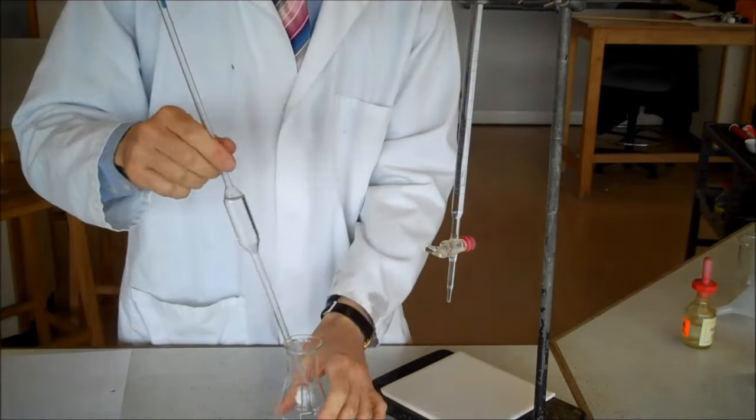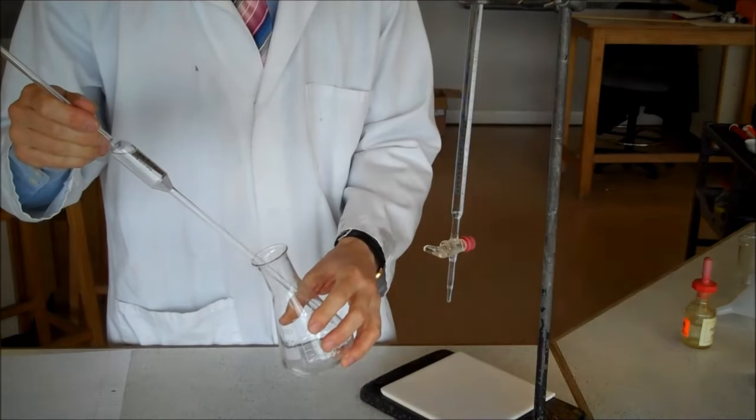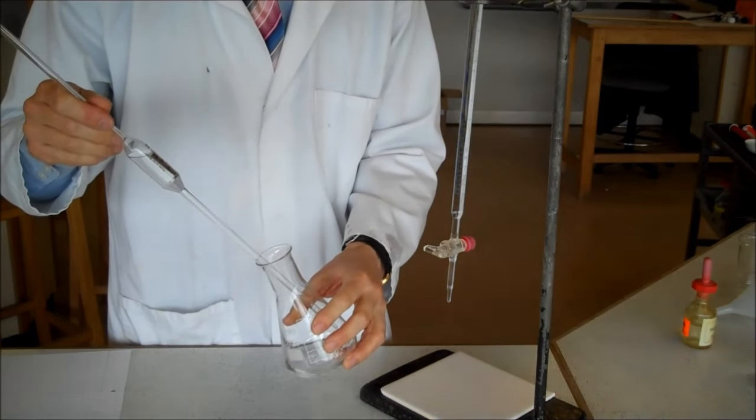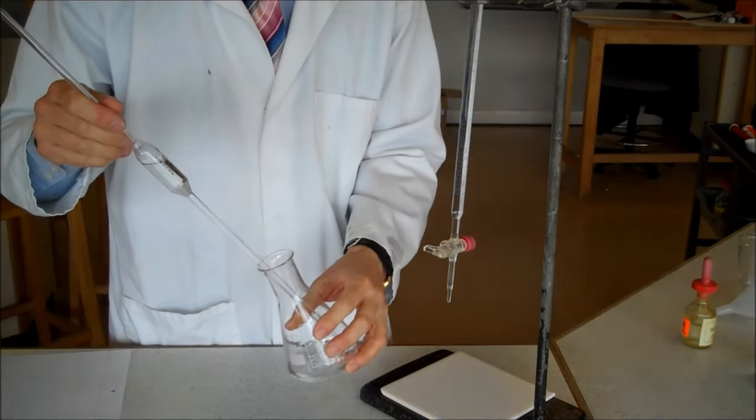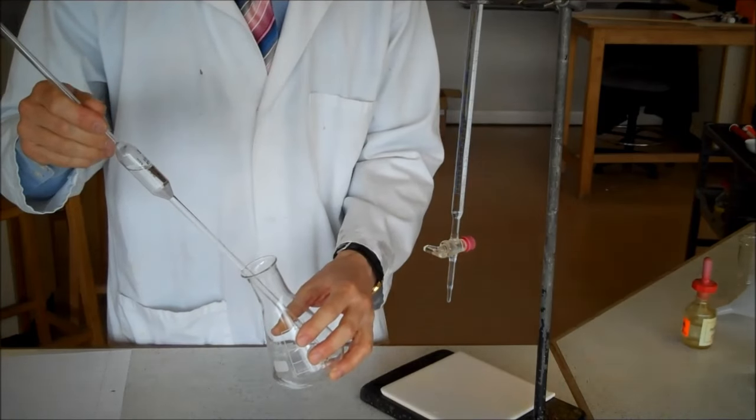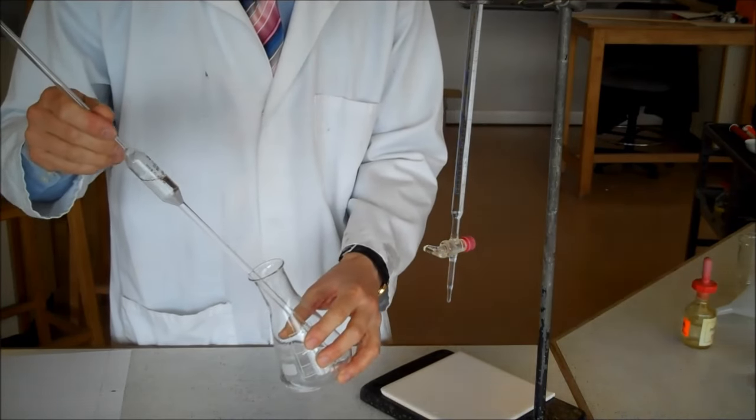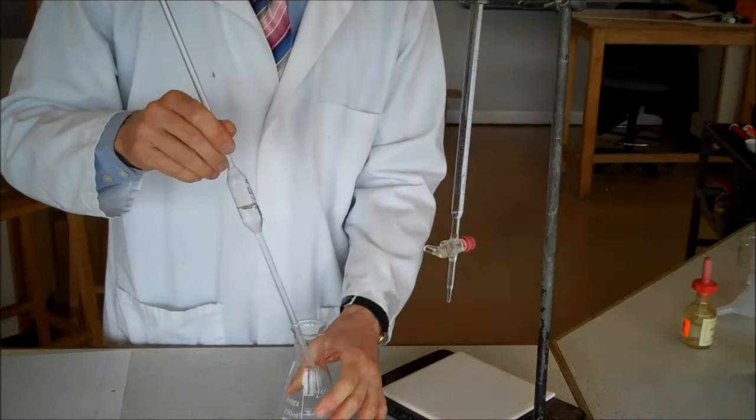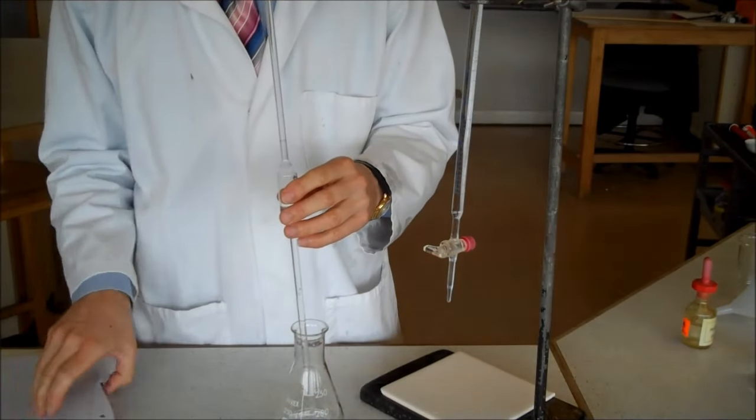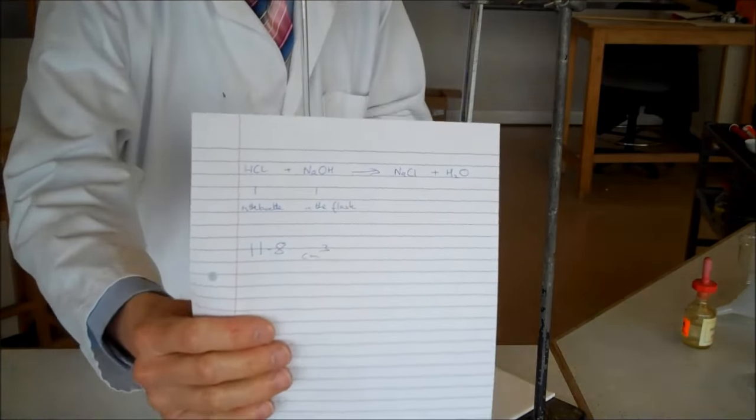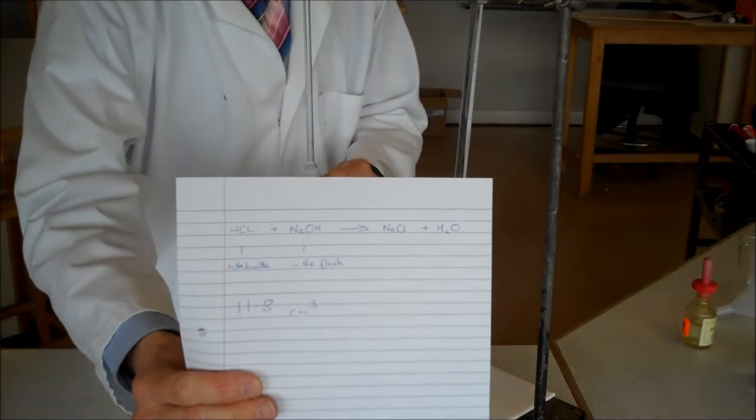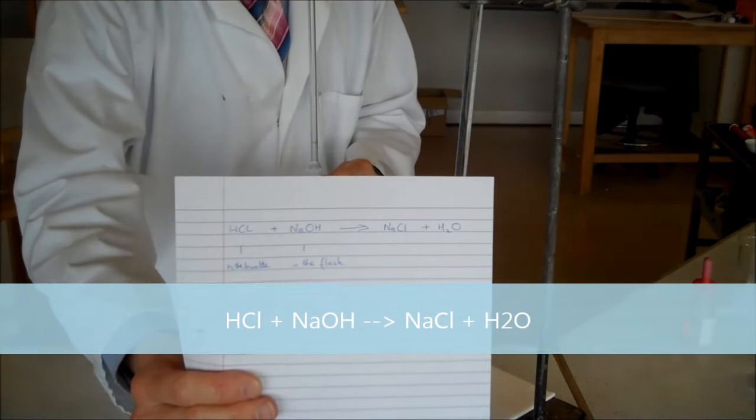So this time, my burette has a different purpose. I'm simply going to add 11.8 centimeters cubed, exactly. And once I've done that, we'll be left with a pure solution of sodium chloride in water. There's my balanced equation again. HCl plus NaOH gives NaCl plus H2O.